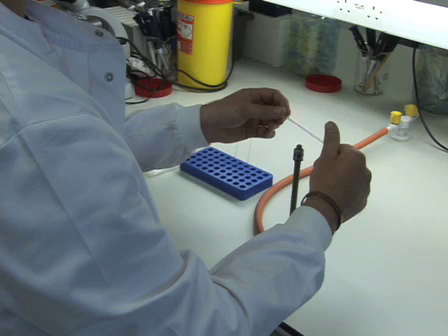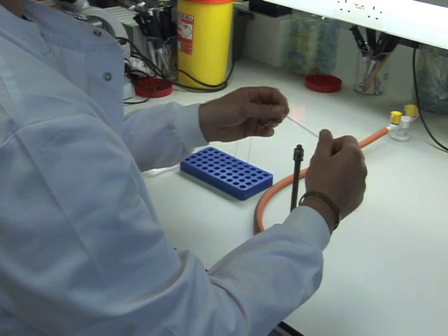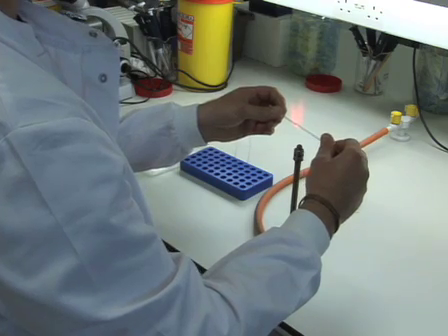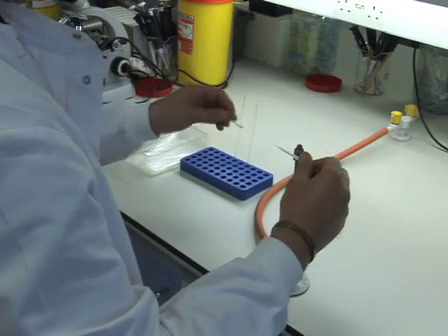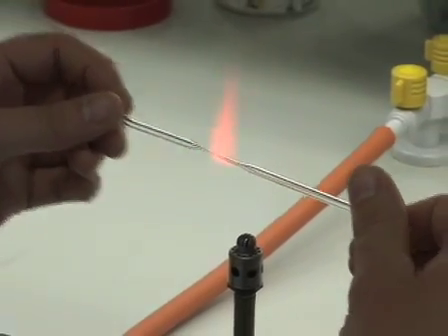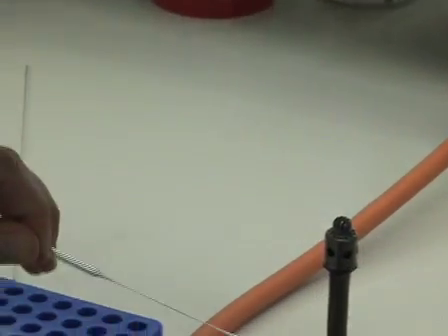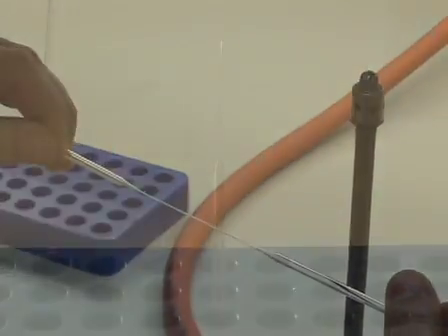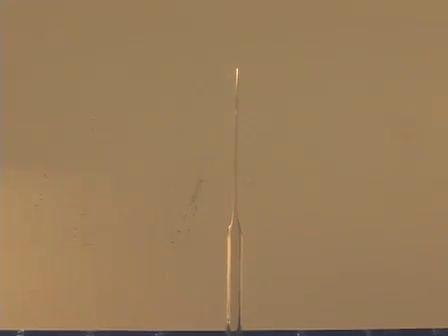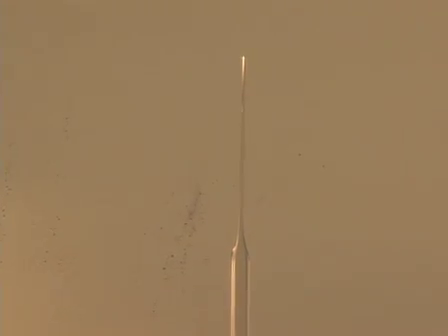To transfer the thymus lobes to the organ culture filter, we like to use a mouth-controlled glass pipette. To make glass pipettes, heat the glass tubing over a Bunsen burner flame and when the glass is pliable, remove it from the flame and pull on both ends to stretch the glass to no more than 10cm. Allow the glass to cool, then pull on each end to snap the glass. This produces two tapered glass pipettes. The thinned area of each is about 5cm long with a tip of about 0.5mm in diameter.